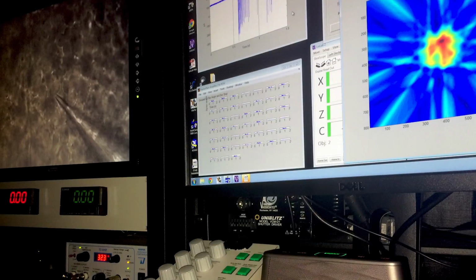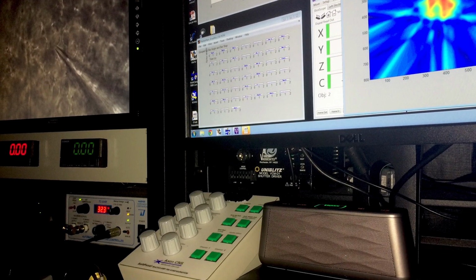measurements of the full output of the retina, right? So we can stimulate with light, which is of course the natural input, and we can record the spikes of the retinal ganglion cells, which are the complete output of the retina. So those two things combined make it a really spectacular system in which to trace the way information flows through a full neural circuit.